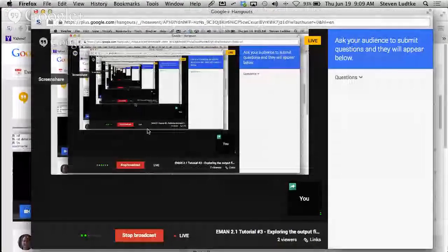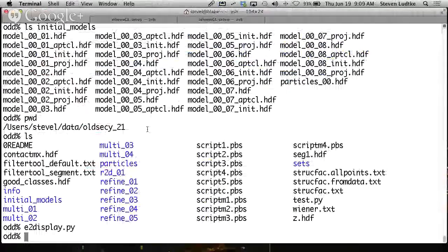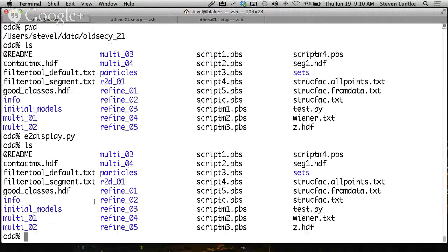So I'm going to start again. If you've already watched the first 5 minutes or something of this and some of it came through, we may have a little bit of repetition here, but again, since I'm not sure exactly where it stopped before, I'm not sure where I need to pick up. All right, so we're going to look in this refinement directory, and we're going to start with the R2D01 subdirectory. That's the result of a refine2D job.